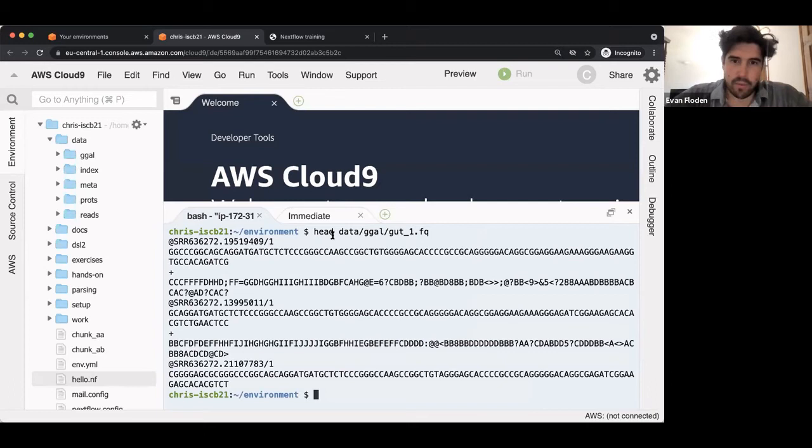We're also going to run in parallel some quality control on these reads to make sure that they're fine. And then the last step, we're going to bring everything together and generate a MultiQC report, which can be used to look at both the quantification step, but also the FastQC step. And that should run through that.